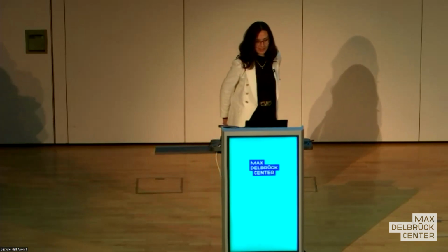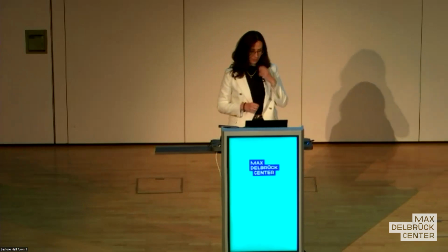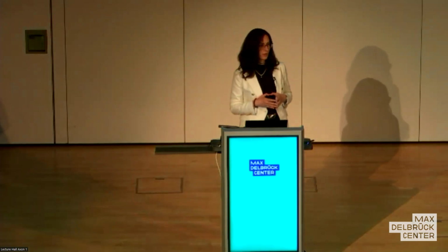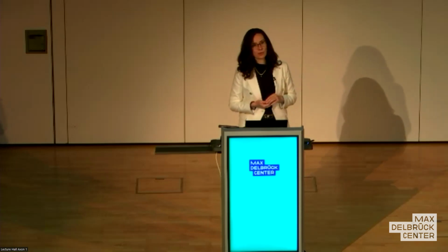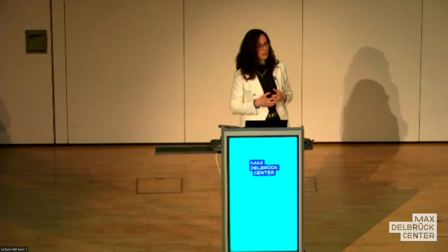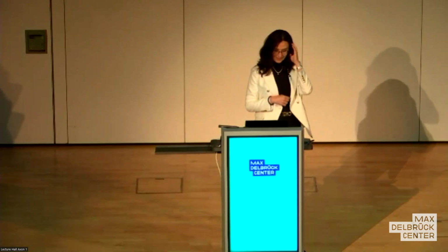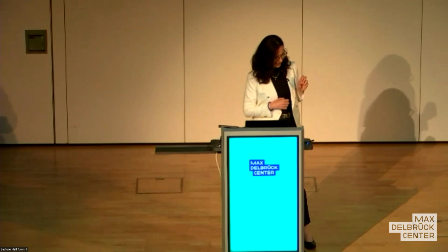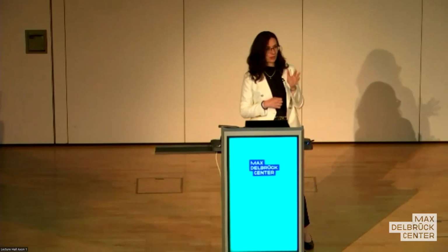Yes. I've seen some work that hasn't been published. As an examiner, I saw really nice work where they derived cells from progeria patients and saw if they would accelerate aging. I think that's a really great use of these organ-on-a-chip systems. My only caution is you have to figure out if your cells are matured properly, right?